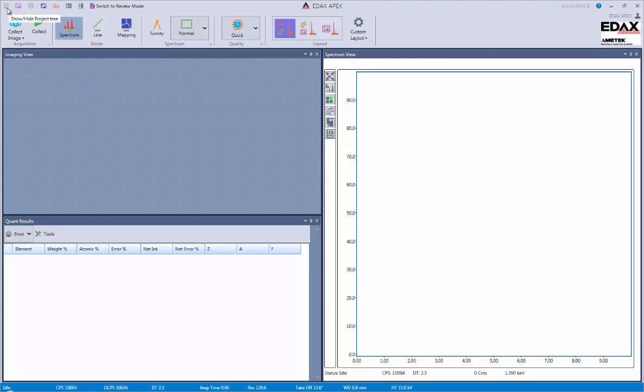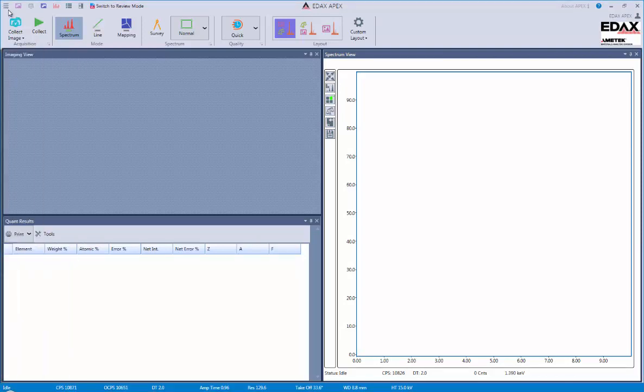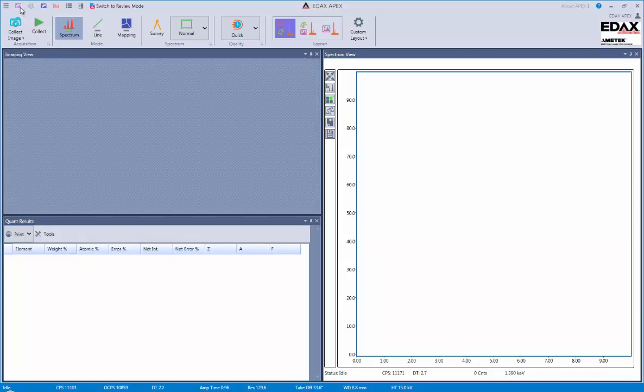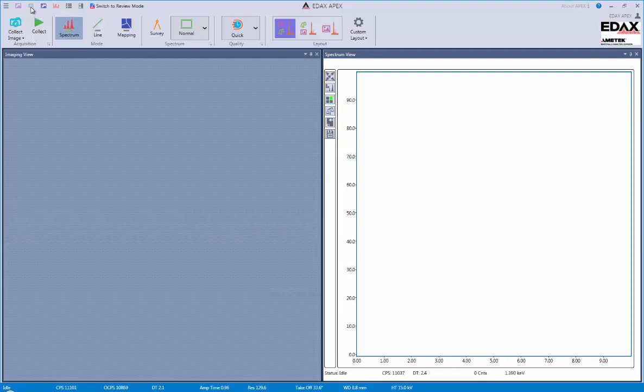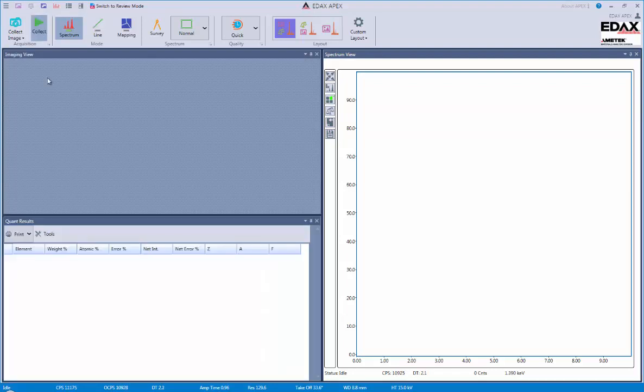On the top file bar, we have various options available to us. The first one is to view and show the project tree, and this is where all of our data will be stored automatically. Next, we can show and hide the image, which is one of the panels that we have working with us while we're in spectrum and imaging and mapping mode. We could also show and hide the quantitative analysis area and also the mapping if we're in mapping mode and the spectrum.